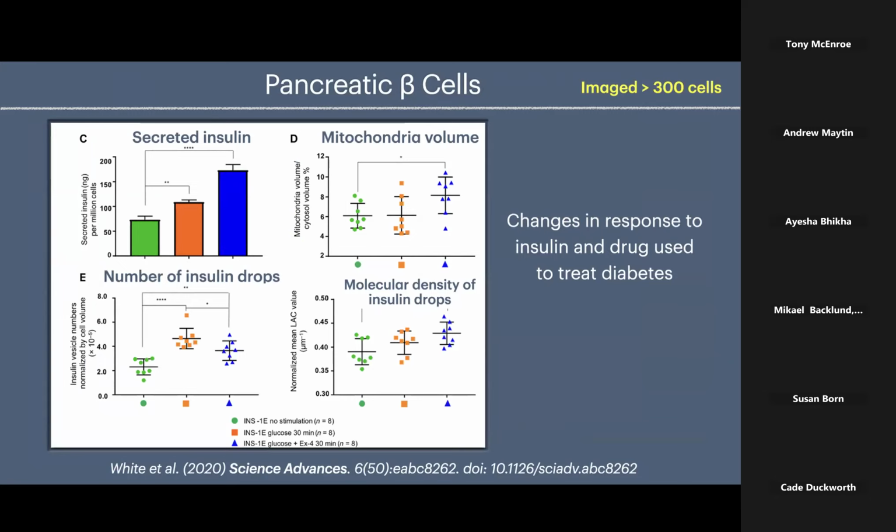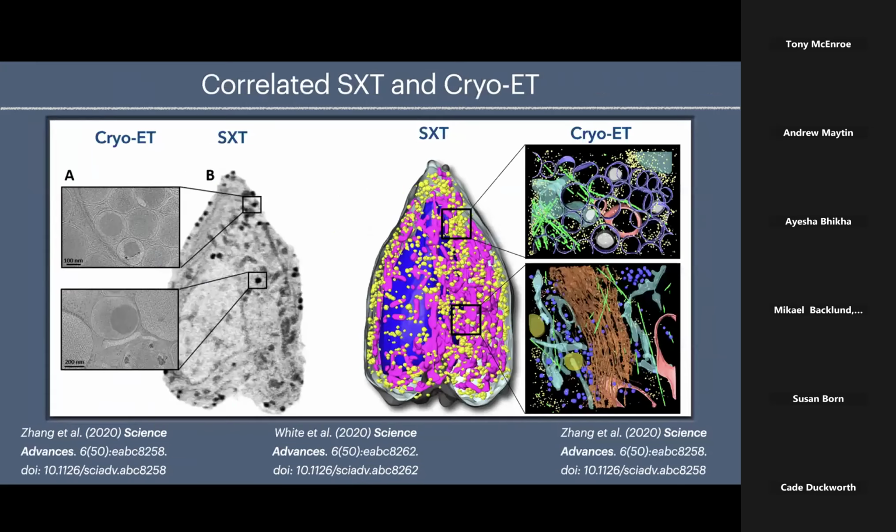And what it means is you can identify the pancreatic granules. You don't have to have a labeled mouse model. You can do it in humans. So you can get pancreas from human tissue and study the insulin granules without any labels.